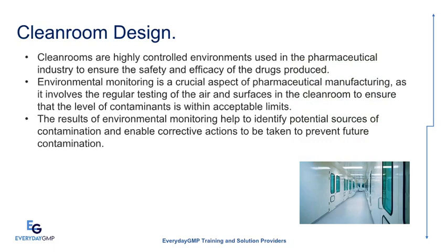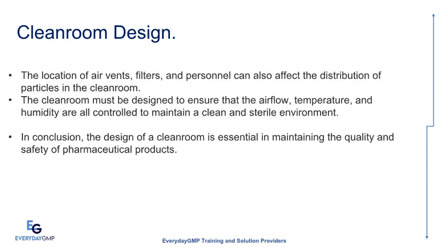Cleanrooms are highly controlled environments used in the pharmaceutical industry to ensure the safety and efficacy of the drugs produced. Environmental monitoring is a crucial aspect of pharmaceutical manufacturing, as it involves the regular testing of the air and surfaces in the cleanroom to ensure that the level of contaminants is within acceptable limits. The results of environmental monitoring help to identify potential sources of contamination and enable corrective actions to be taken to prevent future contamination. Cleanroom design: the location of air vents, filters, and personnel can also affect the distribution of particles in the cleanroom.